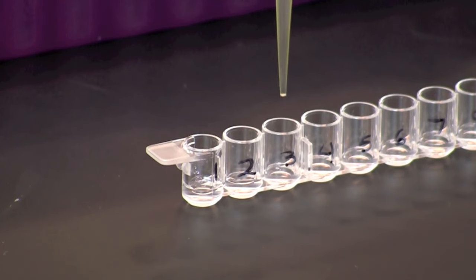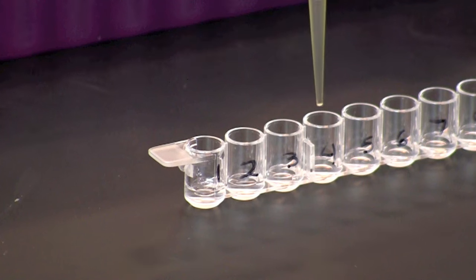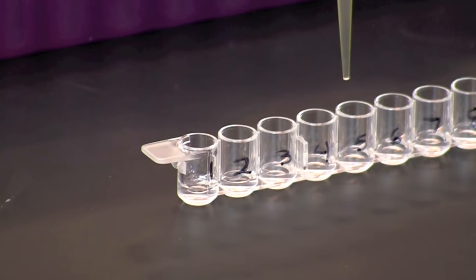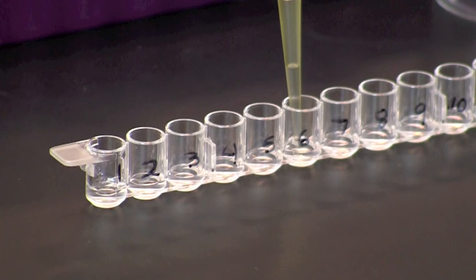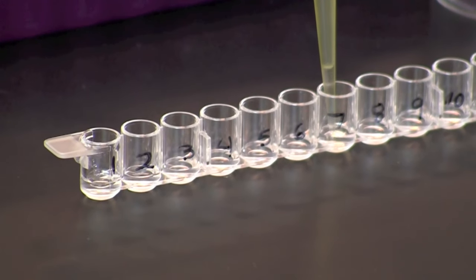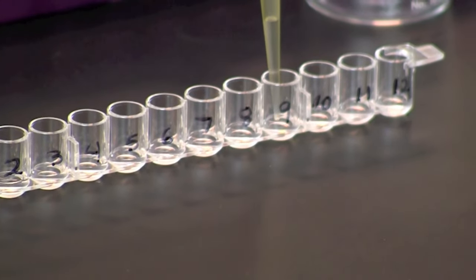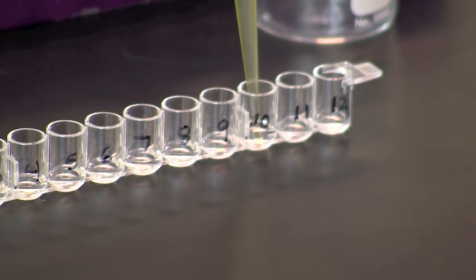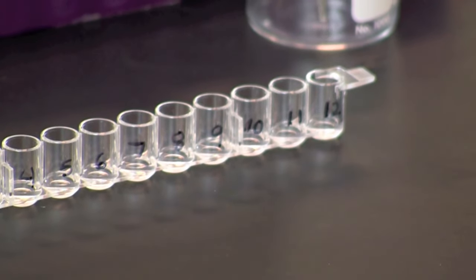Using the same pipette tip, transfer 50 microliters from well number 2 to well number 3 and mix as you did in the previous step. Repeat this transfer and mixing step, moving to the next well each time. Stop when you reach well 11 and discard 50 microliters of solution from well 11 into a waste container.